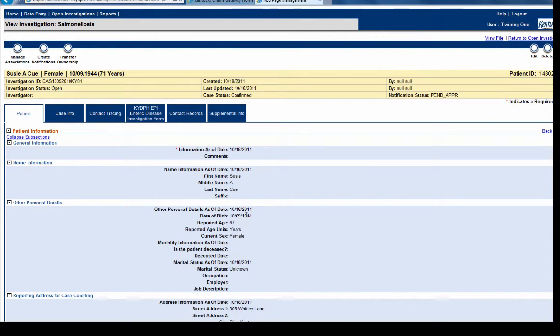Alright, that is all the information that we're going to add for Salmonella, because most of the training that I want to do today is going to revolve around Shiga toxin producing E. coli, because that seems to be the most difficult test entry for the diseases that I cover. So we're going to go ahead and pause and get started on the Shiga toxin producing E. coli.